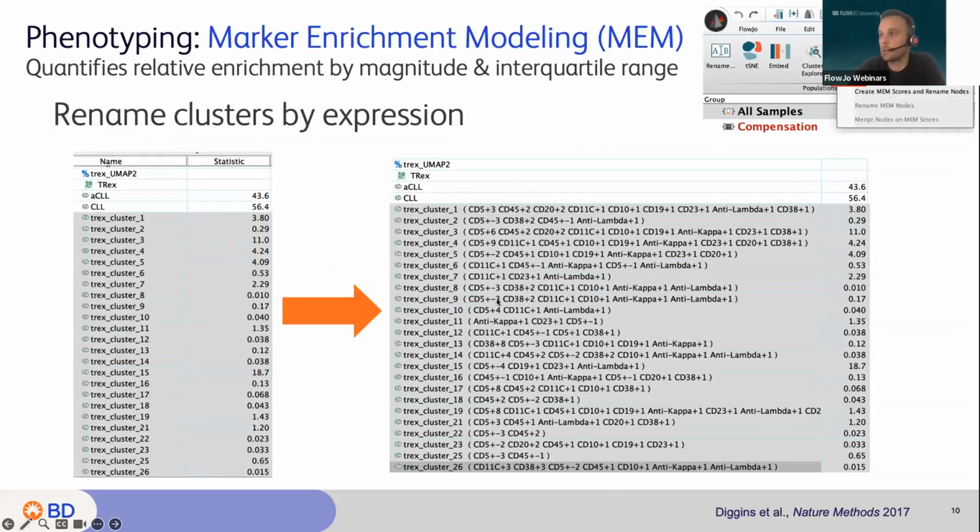That means it is a negative thing. The plus is going to be removed in the newest version, the new 10.9.1 version that's going to be released in fall. But yes, that means it's defined with a negative vector of 3.